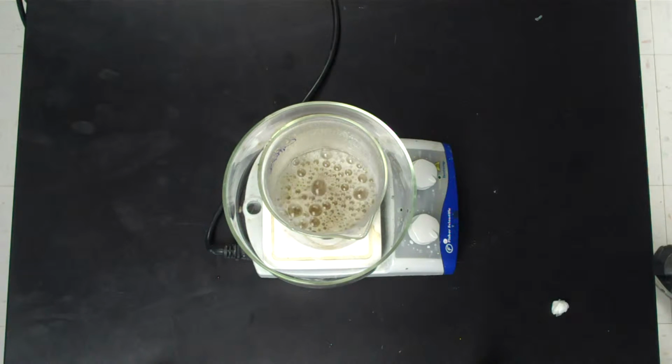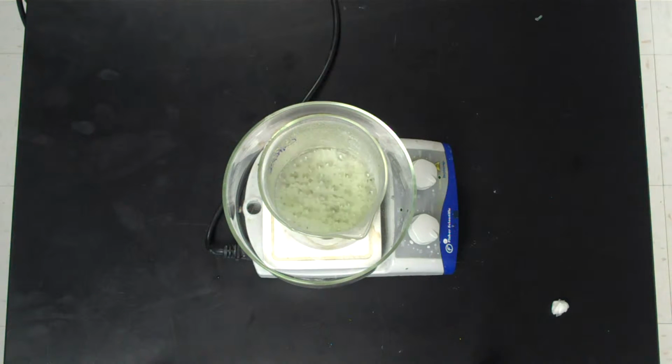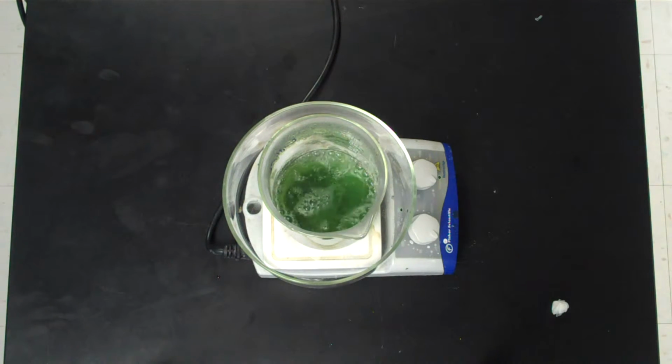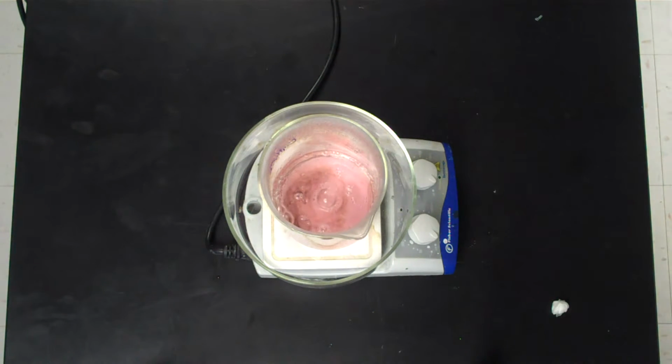The entire formula involves 5 units of hydrogen peroxide plus 1 unit of our tartrate, and it forms 4 units of carbon dioxide, 6 units of water, and 2 units of the hydroxide anion, which our sodium will stabilize, so it'll form sodium hydroxide. If you were watching one of our other demos, we made a pretty interesting way of making our sodium hydroxide earlier.